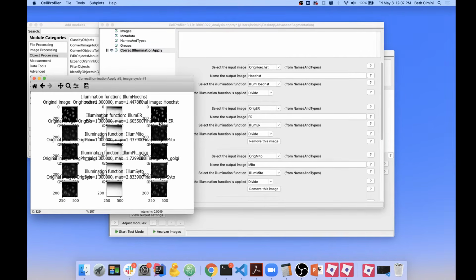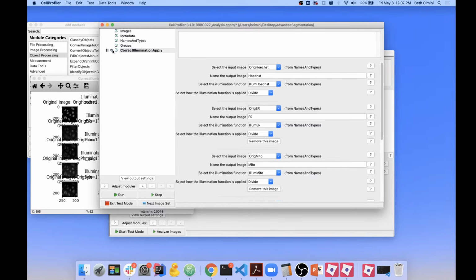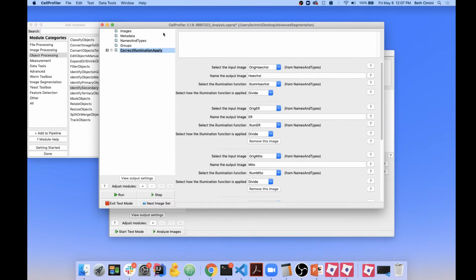If you don't have to worry about this in your experiments, that's fine. This is just something that we find a lot of people do because microscope objectives, of course, are not completely flat. I'm going to close the eye on this here, though, because it's not what we care about right now.